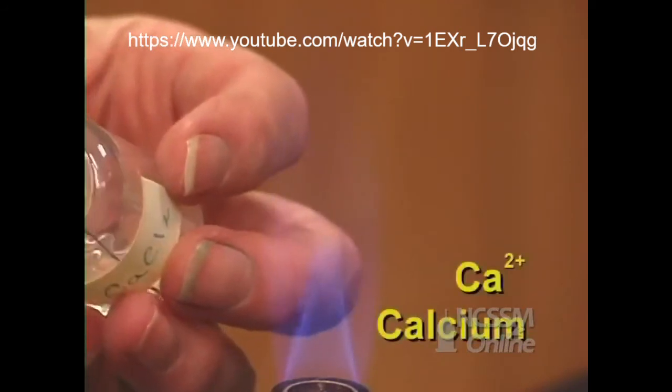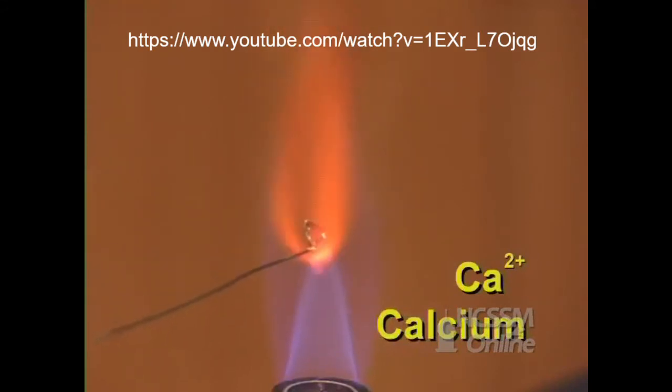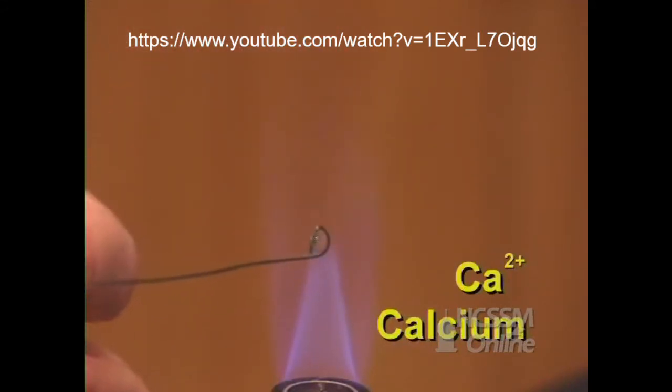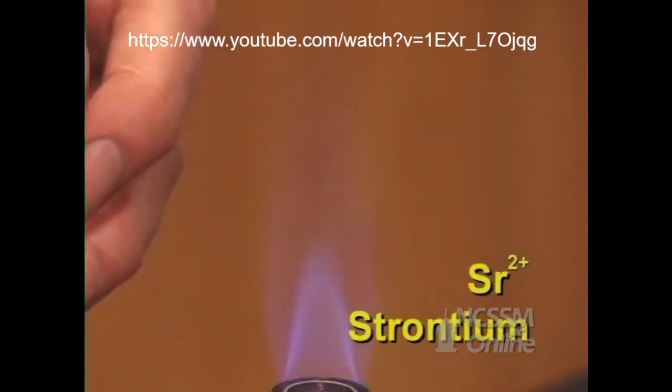This is calcium. Calcium, sort of a yellow-red. Strontium. This one's a pretty red one.